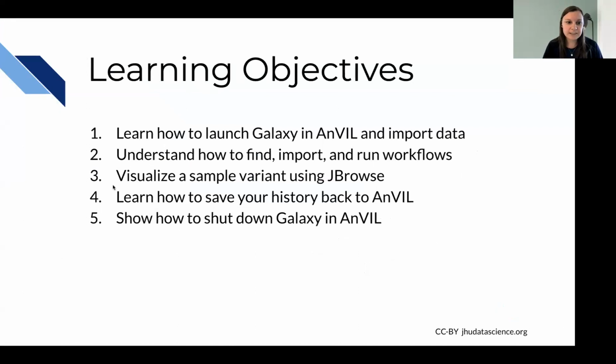So the objectives for today's session are learning how to launch Galaxy in AnVIL, how to bring data from your workspace into the Galaxy environment, and understand how to find and import as well as run workflows on that data. The analysis that we're going to be doing will lead into visualizing a sample variant using JBrowse. So we could jump into that if there's time.